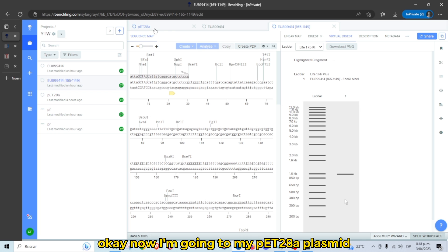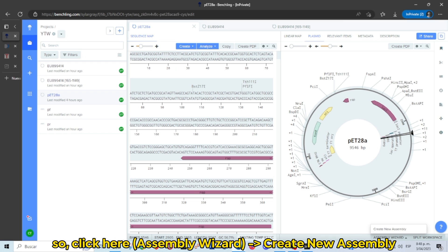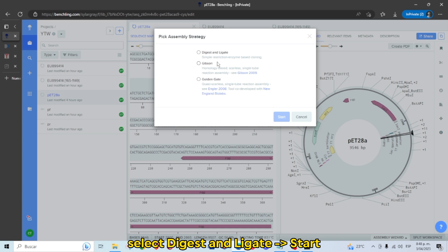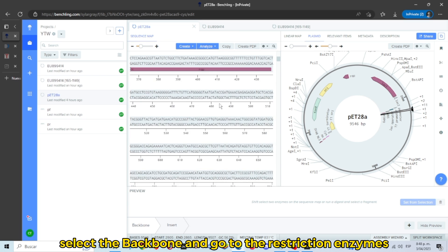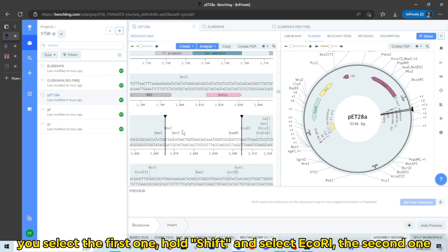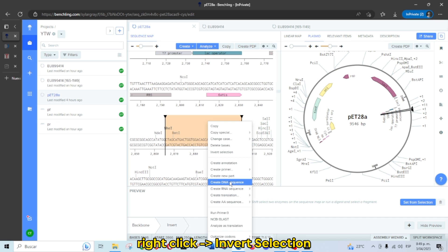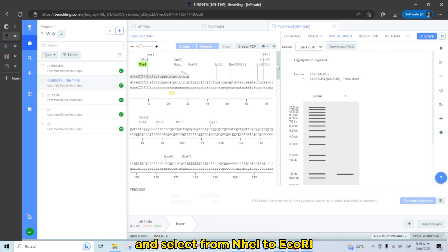Now go to the pET28a plasmid and create an assembly. Click the Assembly Wizard and Create New Assembly. Select Digest and Ligate and Start. Select the backbone, then go to the restriction enzymes. Select the first one, hold Shift, and select EcoRI, the second one. Right-click and invert selection, then click Set from Selection. Everything checks out.